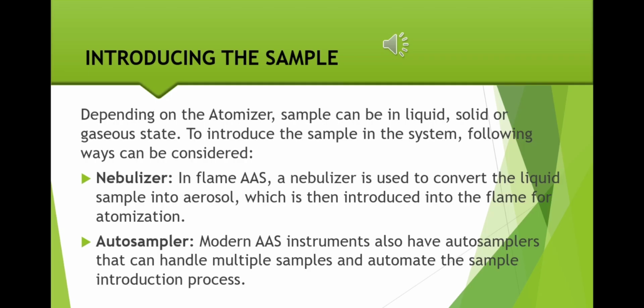The process starts by introducing the sample. Depending upon the atomizer, the sample can be in liquid, solid, or gaseous state. To introduce the sample into the system, the following can be considered: first, a nebulizer, and second, an autosampler.